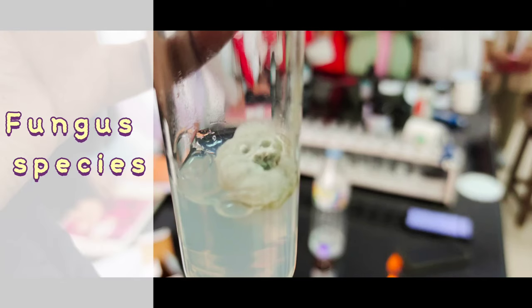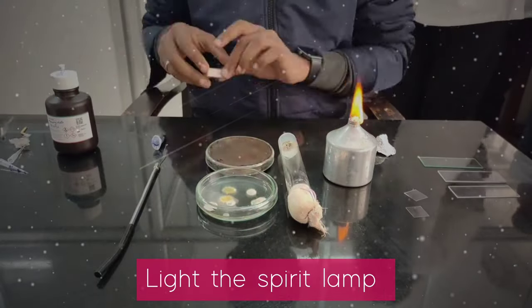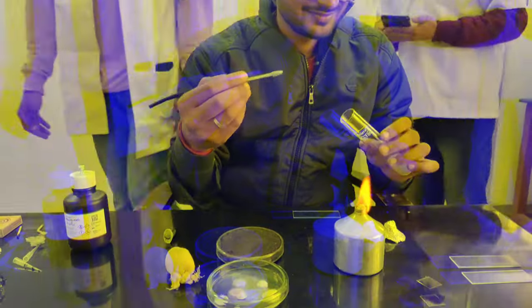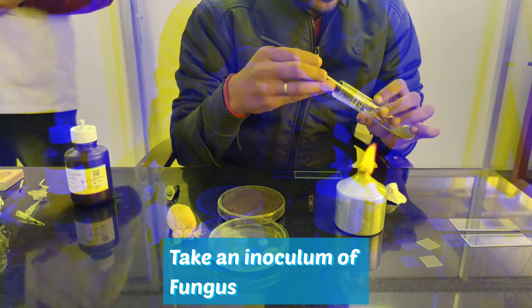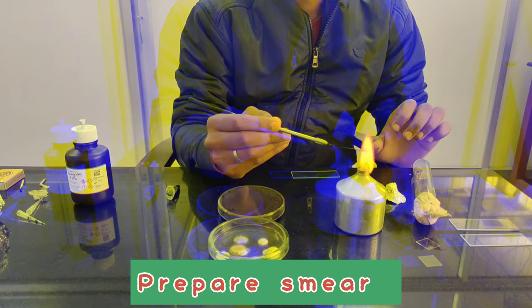Here I have one species of fungus and another species, and I got these species from plant tissue culture labs. I have got a spirit lamp, inoculating loop, and crystallized material, and I have made a small smear.